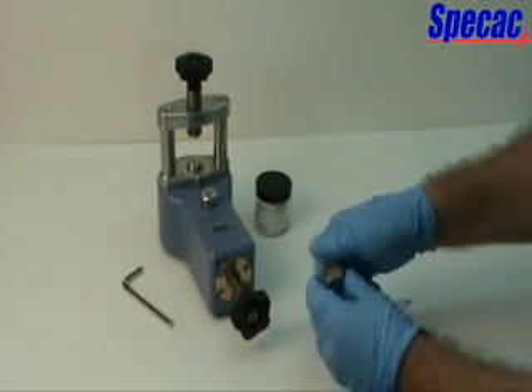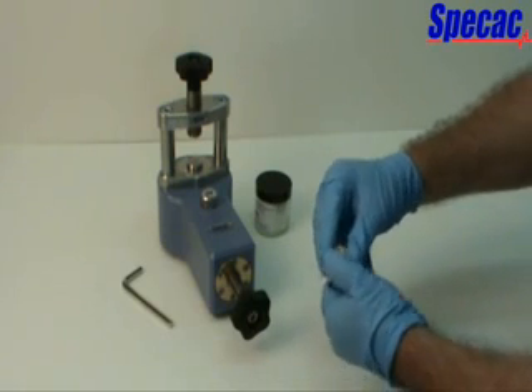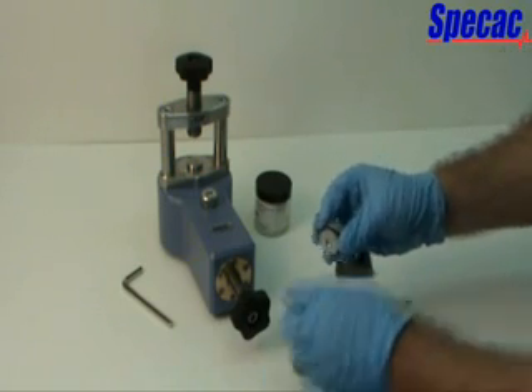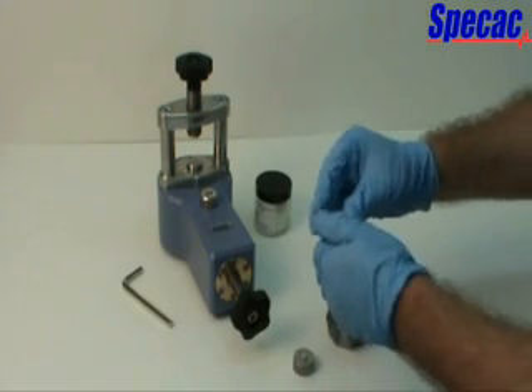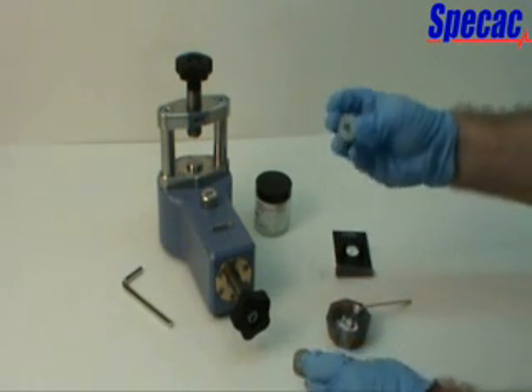Separate the top and bottom anvils from the die ring holder. Hold the knurled outer edge of the die ring holder with one hand and twist-turn the anvils by holding their knurled edges with the other hand. The KBR sample powder material will have been compacted into a 7mm diameter pellet contained in the die ring holder central aperture hole.